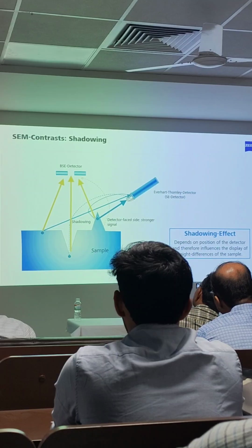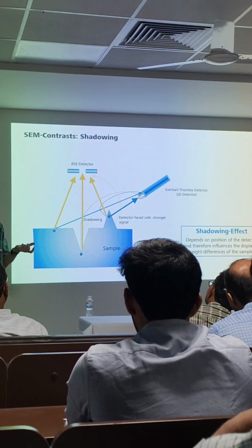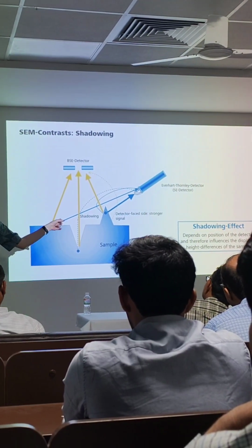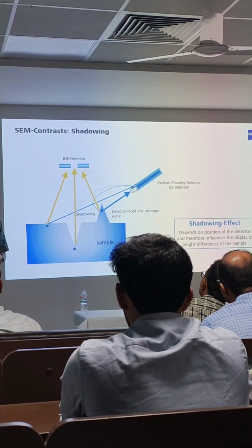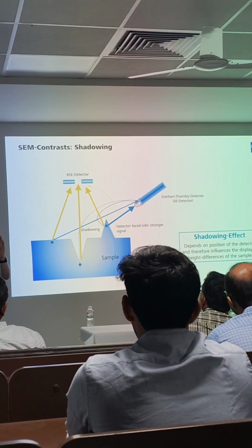What I'm trying to say is that when you have your sample, keep it as flat as possible. And when you say flat, it's not flat by your eyes, it's flat by electron microscopy standards. It will give you a better image, unless of course you're talking about particles.